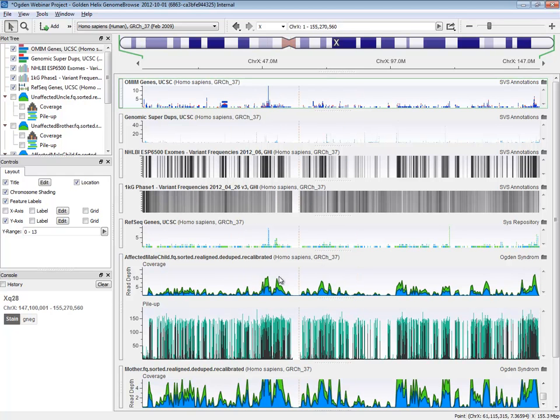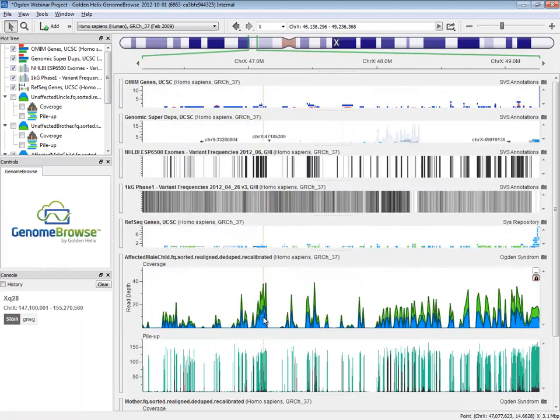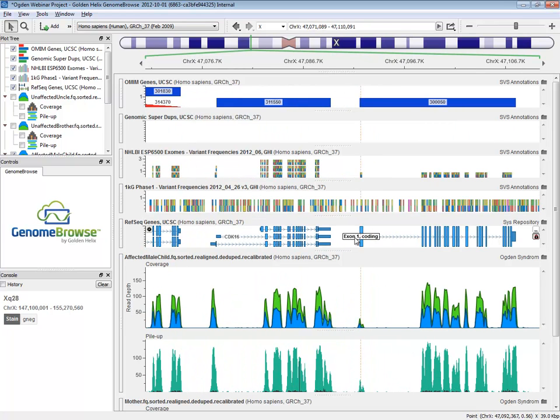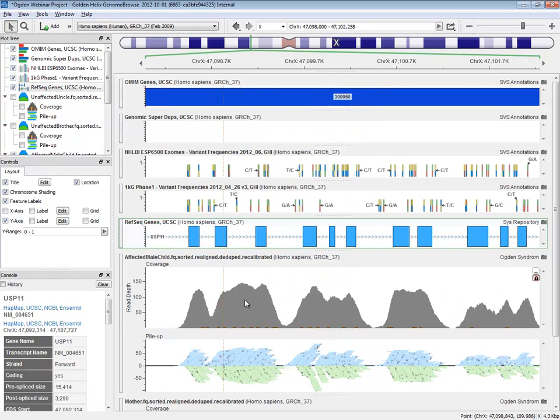The nice thing about Genome Browse is that it's so intuitive. You just start rolling your mouse forward, using a mouse scroll zoom, and you can get down to the place of seeing individual genes, highlighting those, seeing individual variants show up in these variant catalogs, and seeing, as you double click on a gene, the individual reads showing up. In this case, this is an all reference gene. You can see all these annotations, it's an OMIM, etc.